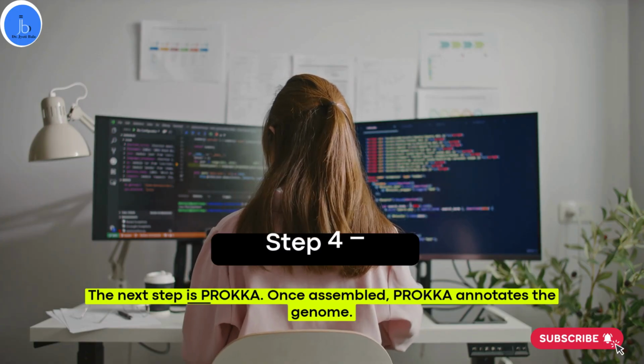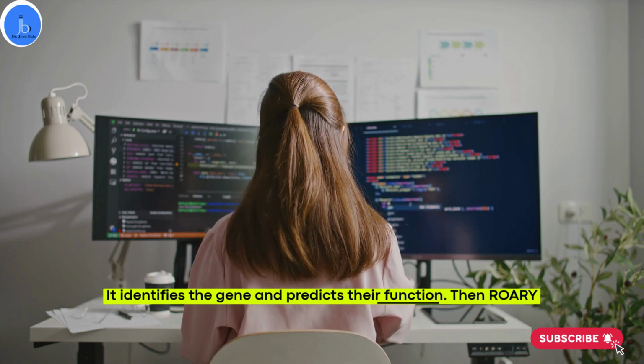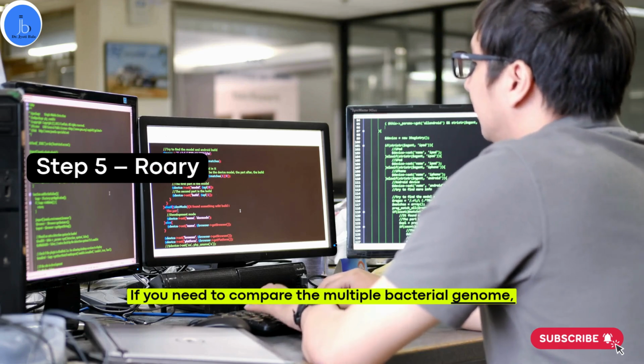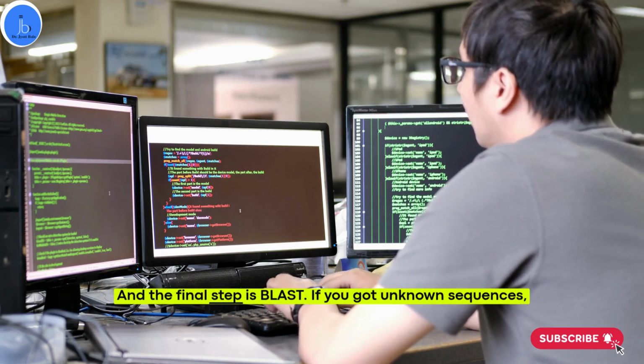The next step is Prokka. Once assembled, Prokka annotates the genome. It identifies the genes and predicts their function. Then Roary. If you need to compare multiple bacterial genomes, Roary performs the pan-genome analysis to find shared and unique genes. And the final step is BLAST.